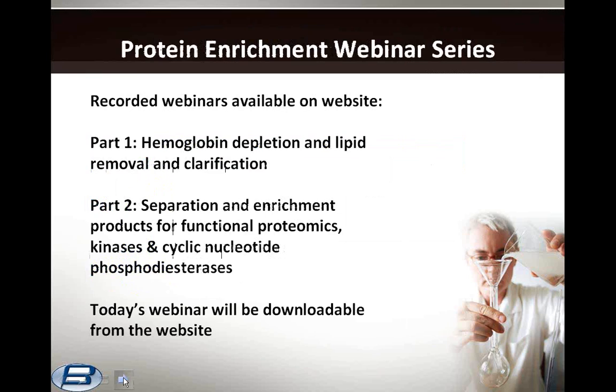This concludes the 3-part webinar series. The first 2 webinars can be downloaded from our website. These covered hemoglobin depletion, lipid removal and clarification, separations and enrichment products for functional proteomics, kinases, and cyclic nucleotide phosphodiesterases. This webinar will also be recorded and posted on the website.